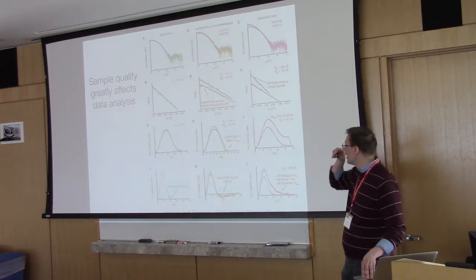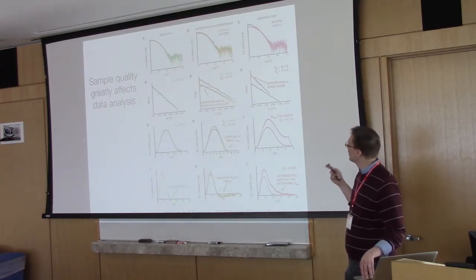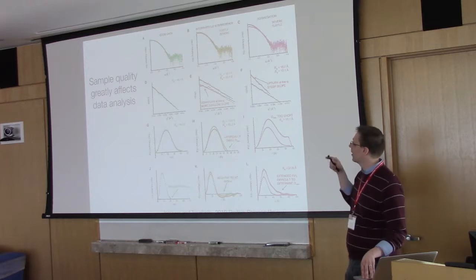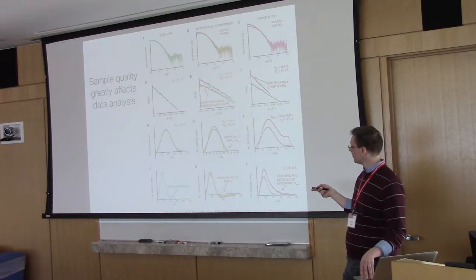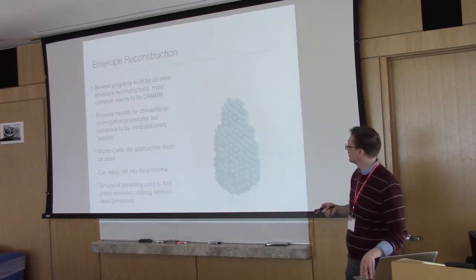This is from that Jacques and Trewhella paper that I mentioned earlier. A nice resource to give you an idea of how sample quality affects data analysis. And I think you've heard a lot of this, so I'm going to get into the modeling stuff because there's a lot to get to.